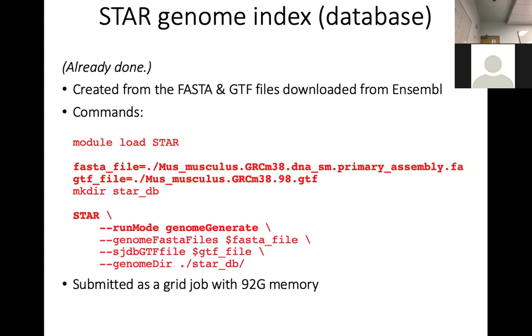Oh, one thing I didn't mention, but whenever you have these Unix command lines, if you see a backslash at the end of the line, that means it's a continuation line. So if you type in the backslash in your command and then you hit return, it's actually not going to run the command right away. It goes to the next line and lets you type in the rest of the command.